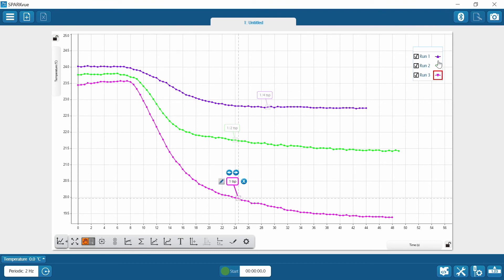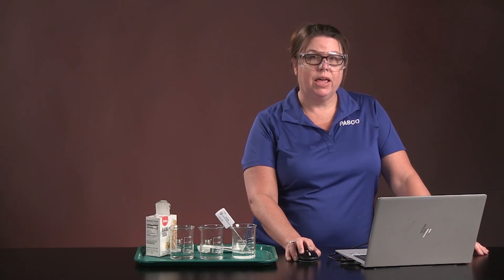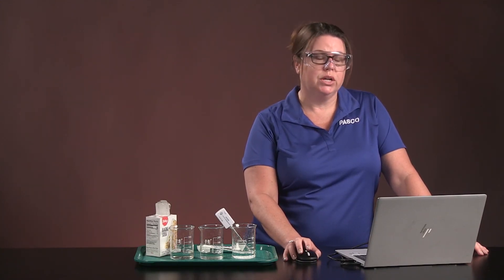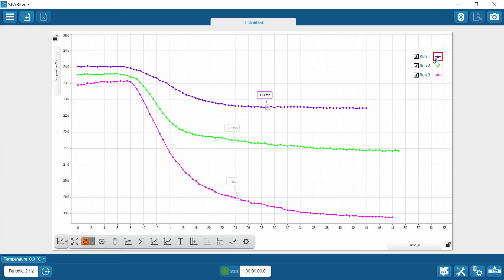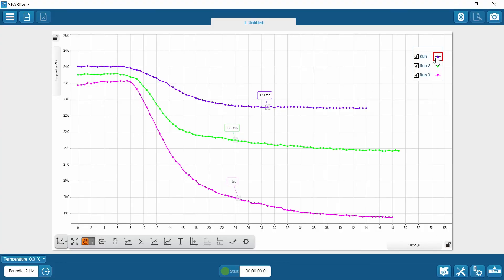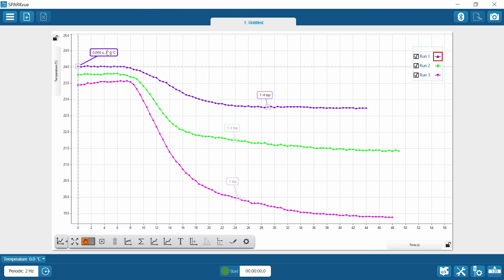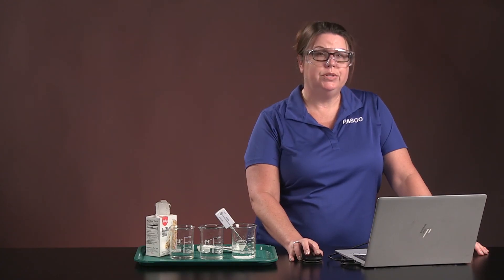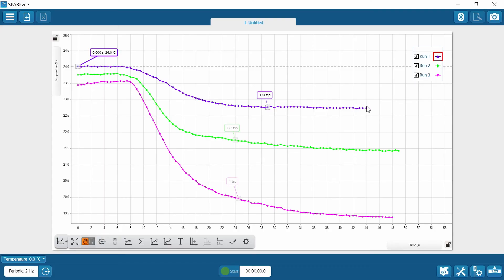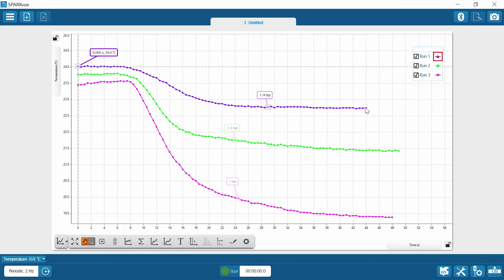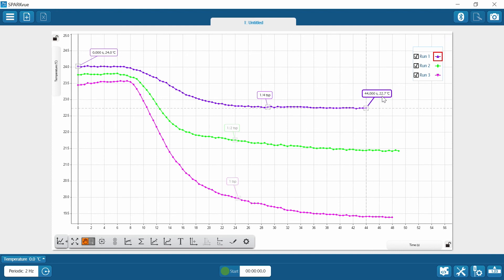Now I want to make sure you understand how to see what the starting temperature and ending temperature were, and we're going to use a coordinate tool for that. I've clicked on run one — that's active. I can click on a data point with the coordinate tool, and it tells me I started at 24.0 degrees Celsius. Clicking on the end point tells me I ended at 22.7 degrees Celsius.